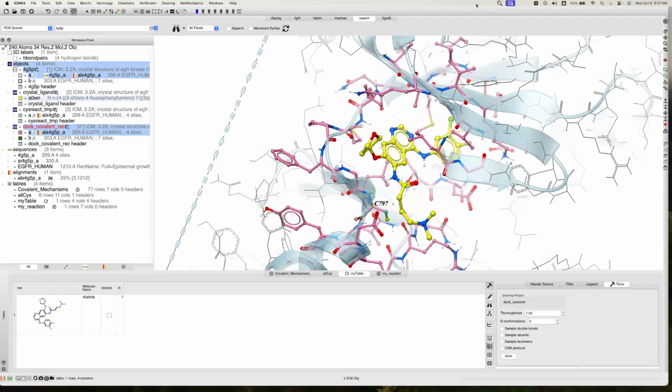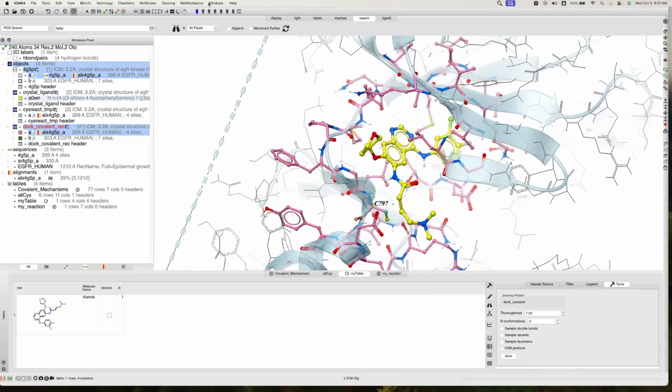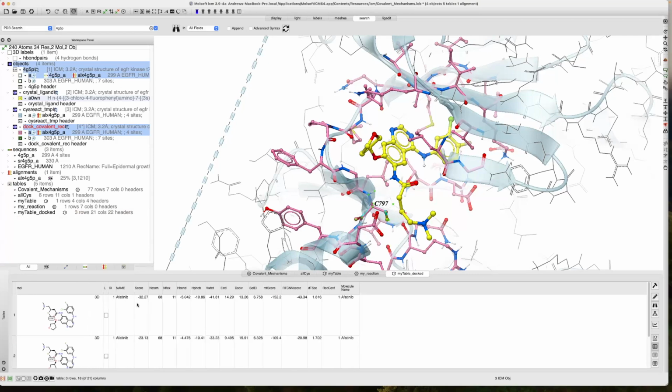And when it's docking, you can see that it says one background job here. This bar will show you the progress. You can also view the docking progress if you go to Windows and choose background jobs, and it will show you. So it's finished docking. So you go OK. So we have the docking hit list with the score and the RTCNN score here.